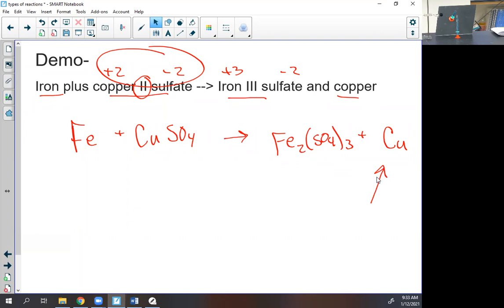Copper. So that paper clip is being coated with copper. It's sticking to the outside. That's why I was able to tap it and have it fall down, sort of like precipitation. That copper sticks to it. It can also be wiped off.